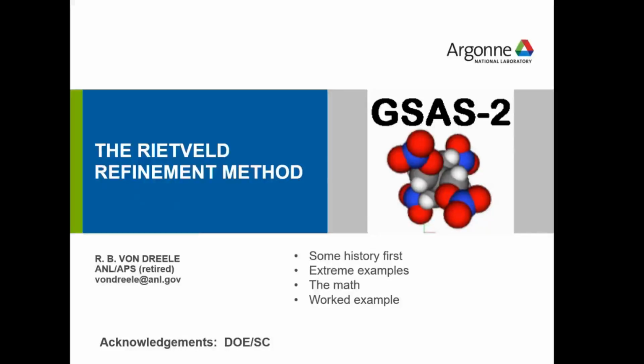By the way, chemists, any chemists? Anybody recognize that molecule? Anybody with an explosive intent in their mind? Its formal name is pentaerythryl tetranitrate. And something with that many nitrates tends to go off with a bang. So this is the high explosive PETN.